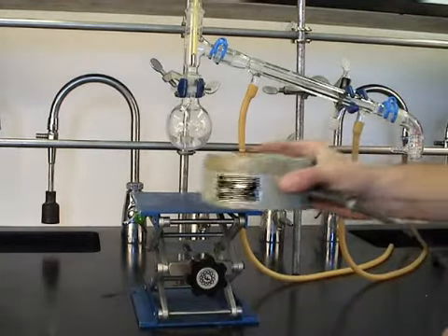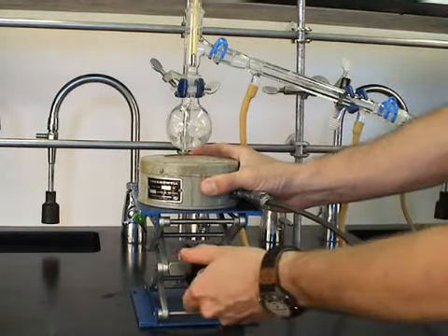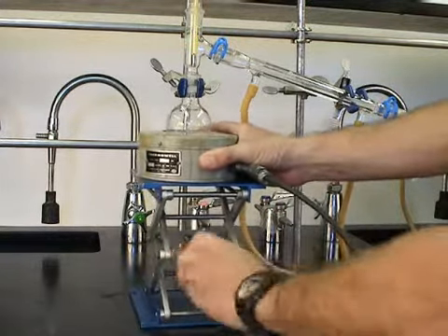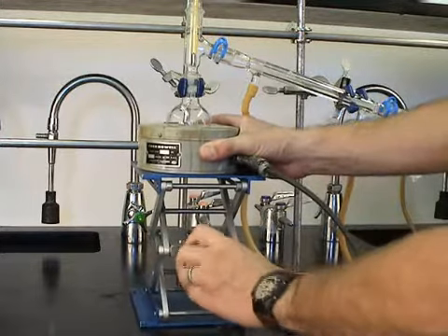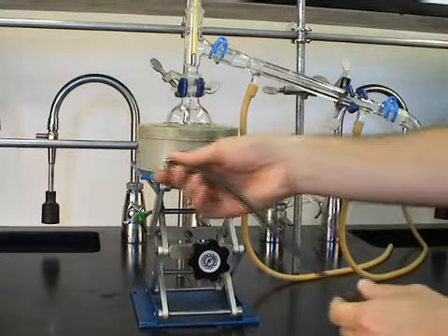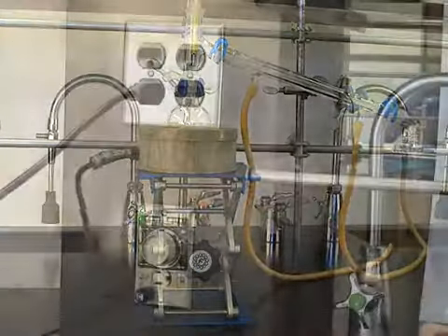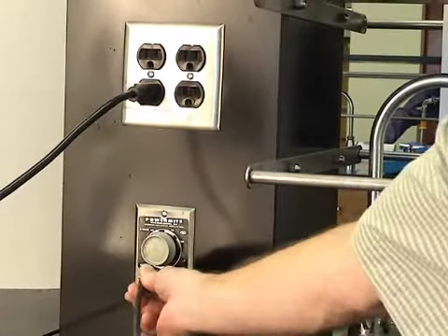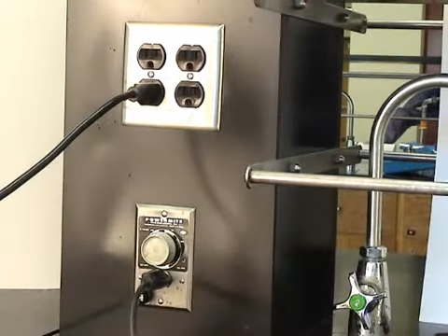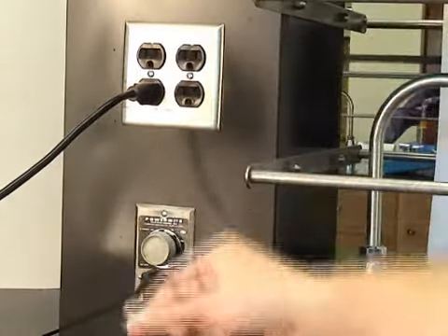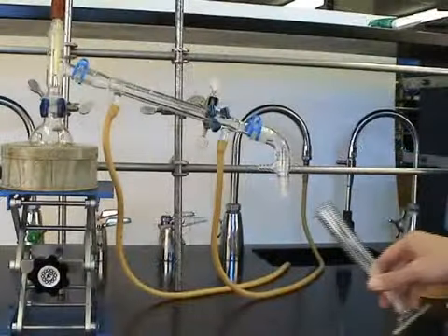We use a jack to support a thermal well. This allows us to adjust the heat quickly if need be by simply raising and lowering the jack. The thermal well is raised up so that it's in contact with the flask, and then connected to the power mite at your lab station. Never ever connect it directly to the 120 volt plug.